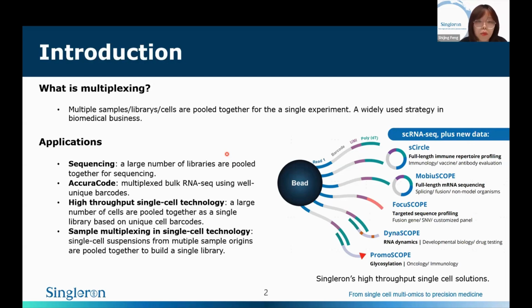First of all, multiplexing is a widely used technique for sequencing. By giving every DNA sample a unique barcode or sequencing index, the samples can be run in the same sequencing lane. This optimizes the sequencing resources as well as the capacity of the sequencing business. After the sequencing is done, the data can be demultiplexed into different samples and sent to every customer.